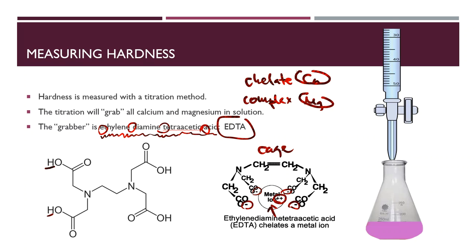This COO group is not really a COO group as far as the structure of EDTA is concerned. So until we get rid of these hydrogens here, we will not be able to do anything with EDTA. That's the number one concern that we have. But if we could make the EDTA lose the hydrogens, then we can create these negative charges on the EDTA.